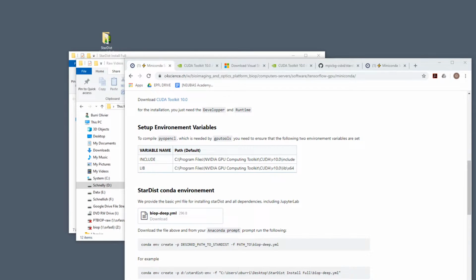So for those of you who don't know, Conda, Anaconda, Miniconda, they're all the same thing. They are a tool that allows you to have different versions of many different libraries and different tools that are managed in such a way that they can coexist. Because you're downloading something from, let's say, one publication that is running on an older version of some underlying library, and then you want to install something new, and by installing something new, it would break your other installs.